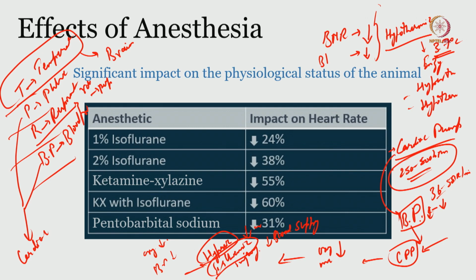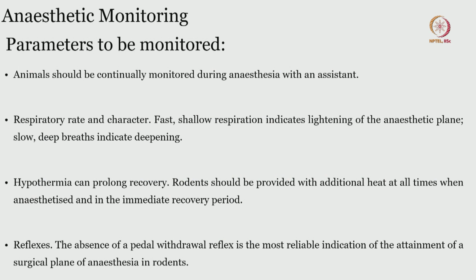The best way is to have a good monitoring system, which will not only help you with the alarms that are happening in a very dynamic range. It also tells you when to stop the surgery, when to abandon the surgery to save the rat's life so that you can at least repeat it later. And it also tells you various side effects of the drugs that you are using, so at least for the next experiment you can improvise.